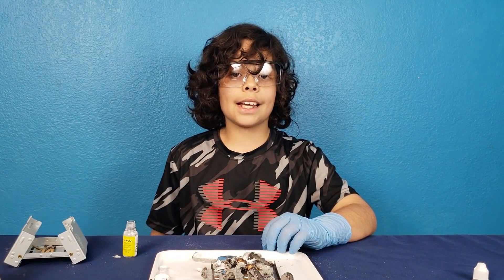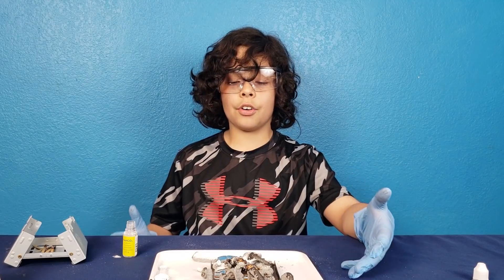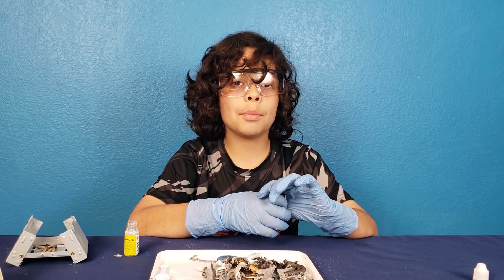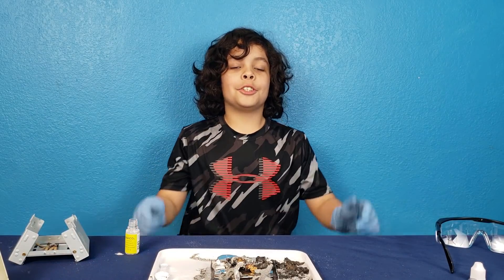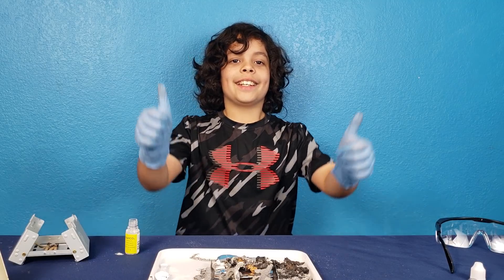Since I'm homeschooled, MelScience is a perfect solution. Look how cool my lab is — it's just right here at home. Who knew science could be so much fun? Even my dad was amazed. Were you amazed, Dad? Yes, I was very amazed. Guess who has two thumbs and is going to win the Nobel Prize in Chemistry? This guy.